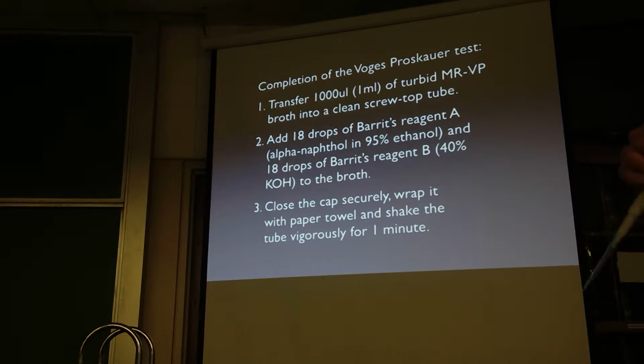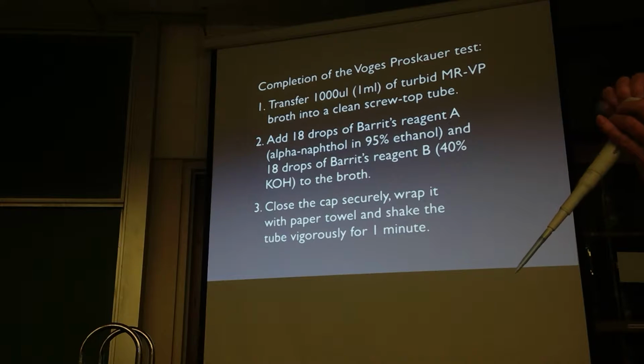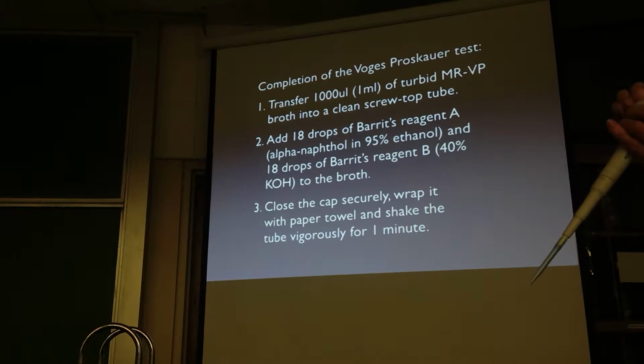That's what this is like. If you try to change gears without putting that in, the pipette will make a terrible noise, and your instructor will screech at you, "Stop it!" Because it's very damaging. So I'm turning this now with the button compressed. I have to change this to read 1,000.